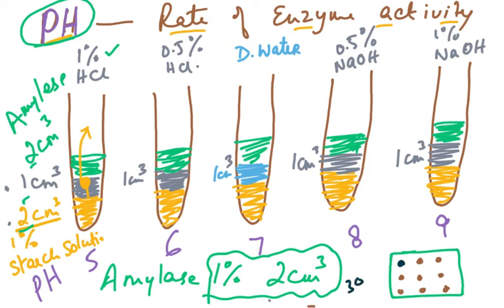Now you will do this after every 30 seconds. And you take another drop from here, and then you mix it. It's black, black, black, black. Now you realize it's black, and now it's brown. So it has taken 30 into 7, 210 seconds for all the starch to be digested. So you did this with the first test tube.